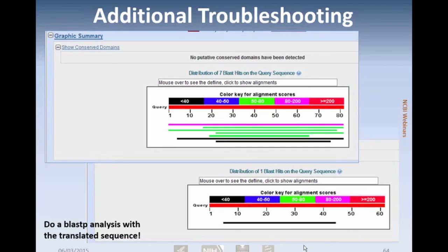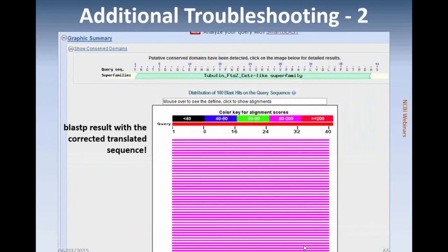As it turned out, the person had the wrong CDS feature annotation for their sequences. When you do the correct CDS feature, this was the result for the beta-tubulin. If you're studying the common molecular markers, you're going to get coverage over your entire sequence and good hits. This is a purple score only because of the length of the protein that I submitted. So always do a BLAST-P analysis with your translation.